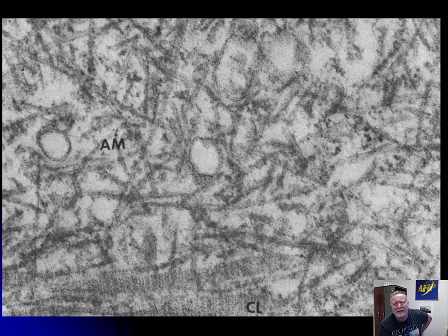Okay, well, that covers all of the basic organelles and some of the intra and extracellular fibrils and components I think that you should know for us to move forward. I hope I didn't teach you too much new stuff, because really, as we said before, the vocabulary and what you know from looking at the microscope is going to serve you very well for the rest of these lectures. We're about 75 minutes. I think we have a good background. We're going to move forward to the next one. Should take about a half hour for cellular degenerative changes, and I look forward to seeing you next time.